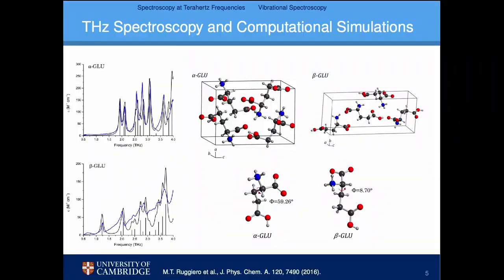Now, you can see the locations and the intensities of the calculated vibrational modes. They're plotted here as vertical black bars, and together with the resultant spectrum when we apply a constant line width to each of those modes. Now, when we compare the theory and the experiments, it's clear from the plots that there is excellent agreement between the two.